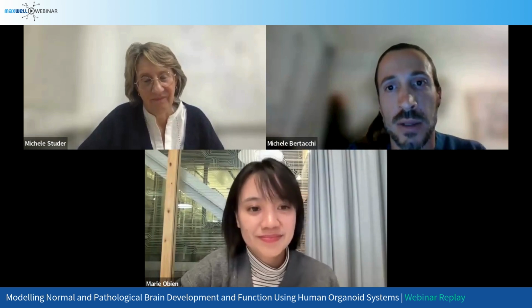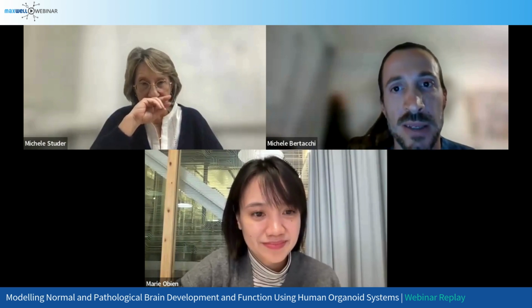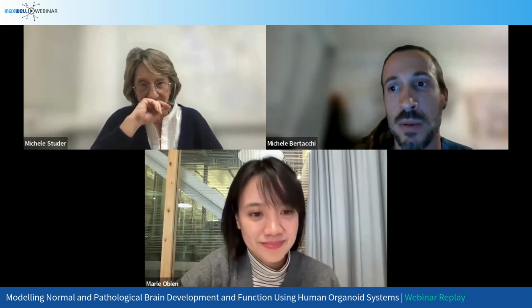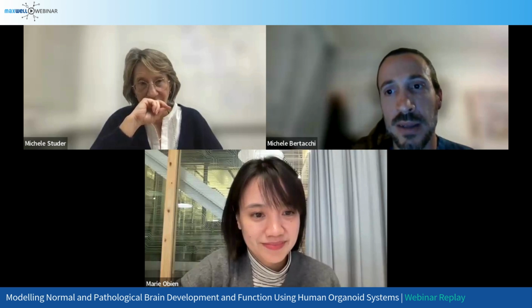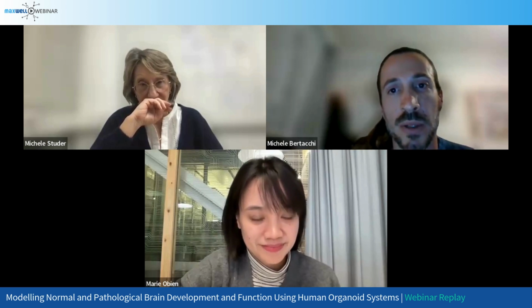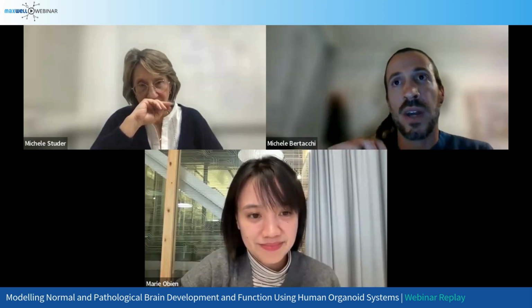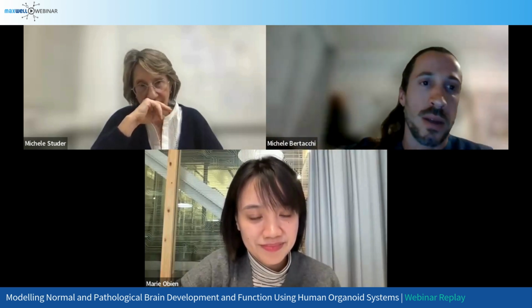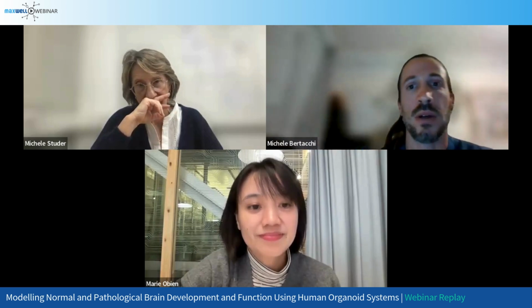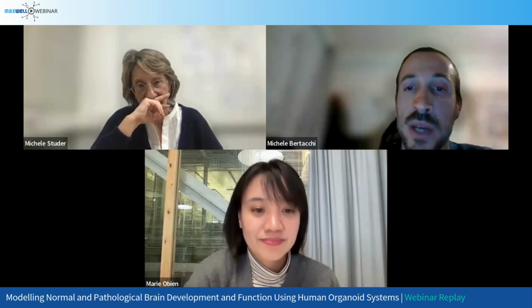So these axonal tracts that are elongating around, we don't know why. Now we are trying different plating strategies to also get signal from the inside of the organoid. I think anyway that it could be representative of the whole organoid network because they're connected. And so even if you're recording only from this surface and from the outside part, the signal is also coming from the network, from the part that you cannot access during the recording.